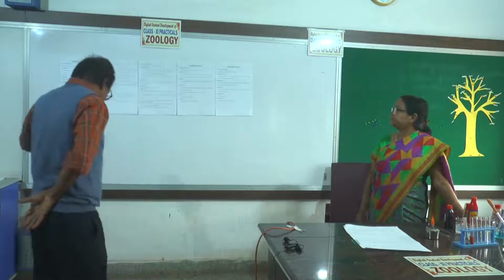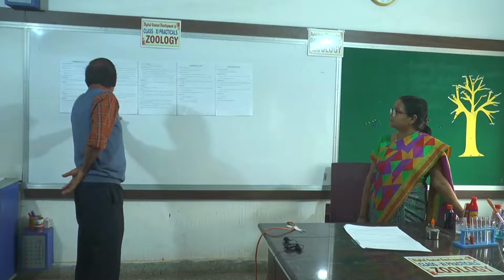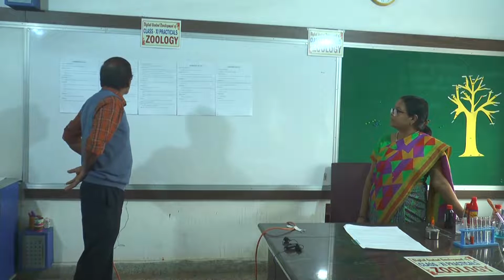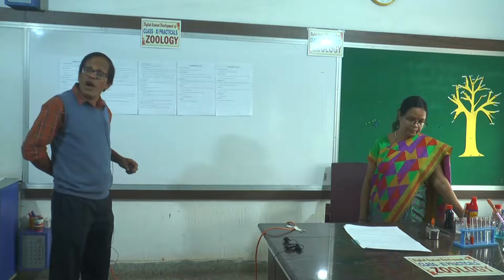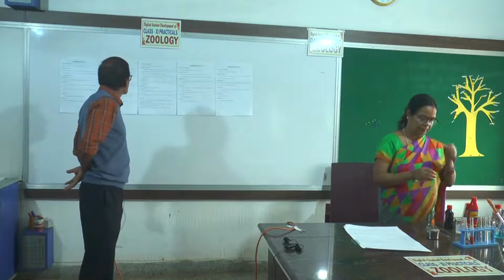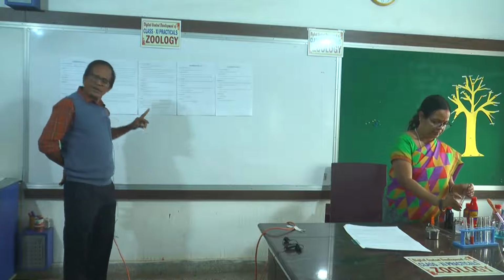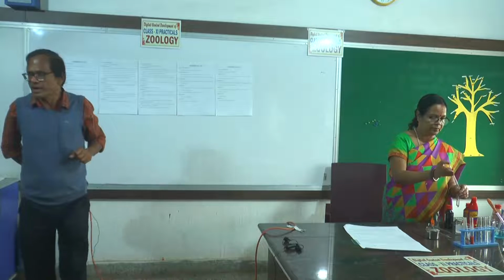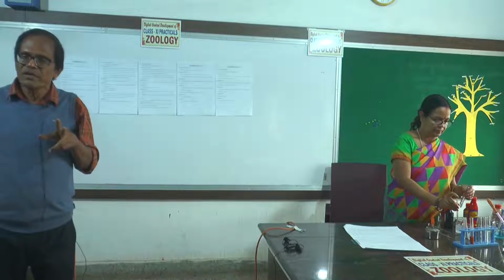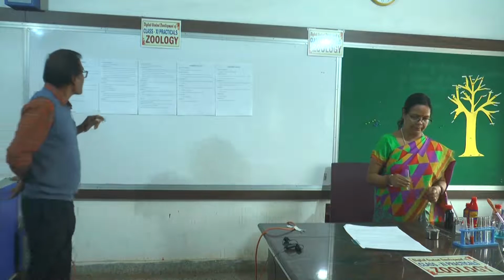Anyway, this is all about the reducing property. I have already gone through it. The next is the determination of the presence of starch in a sample solution. All carbohydrates exhibit, as I have already discussed, the Molisch test. They are positive with the Molisch test.